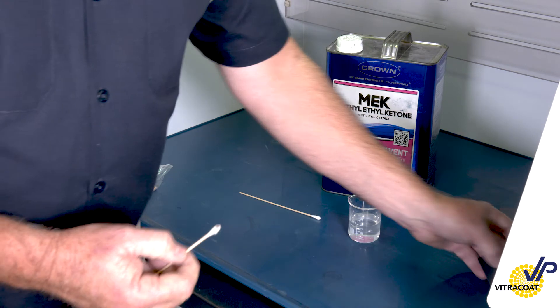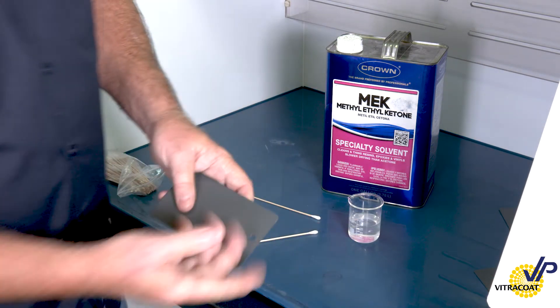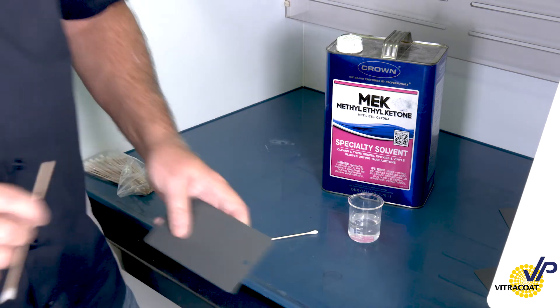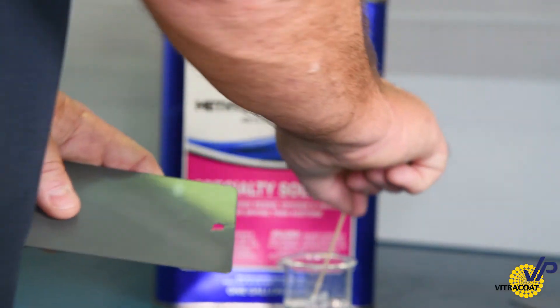Now I'm going to do that same test with this panel. As you can see, the panel itself doesn't look much different than the known cure. But we know that this is under-cure because we did it in the lab, and I want to show you the difference in the way this product performs to chemical resistance when compared to the known cure.